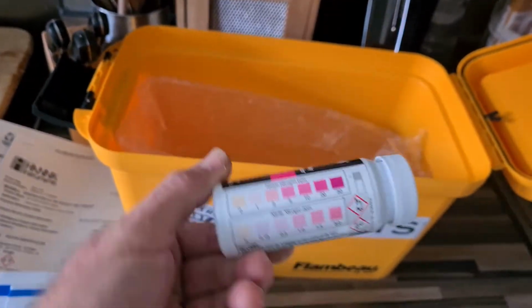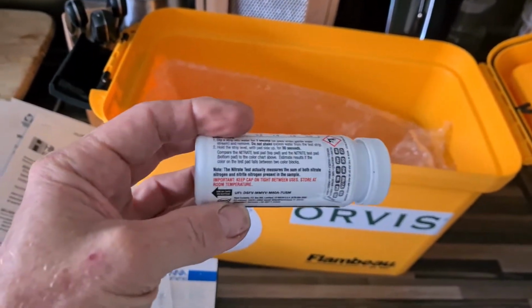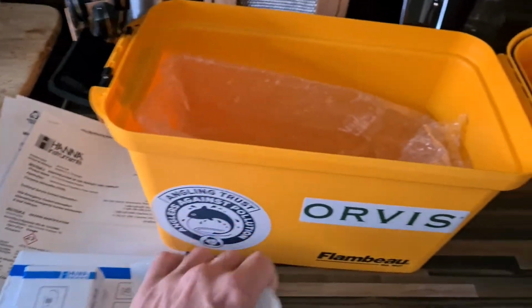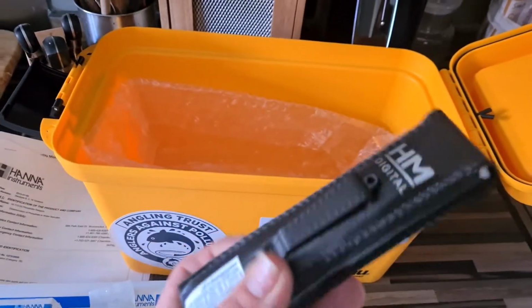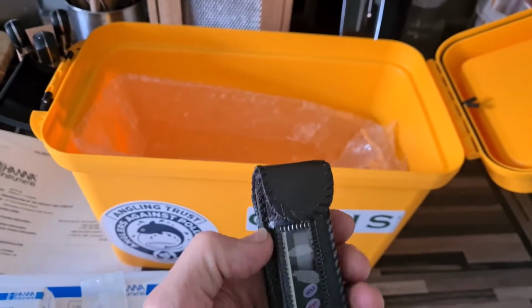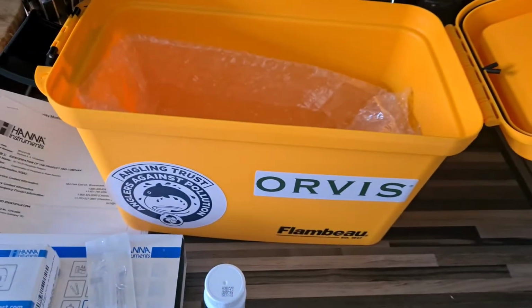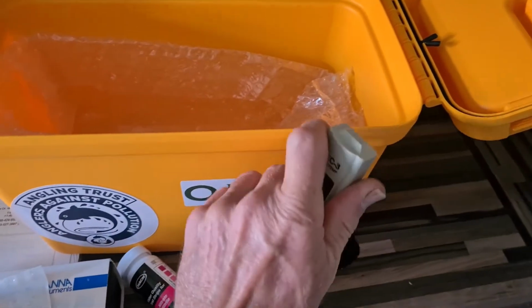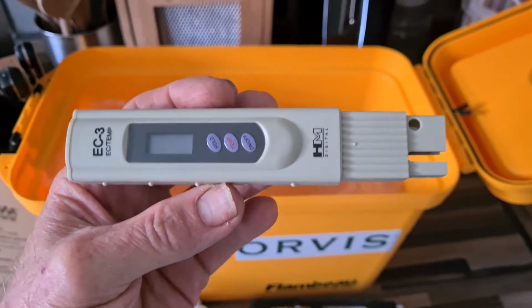Nitrate test strips and your comparison chart on the side. Okay, there's all the details on those laminated sheets of how to use those. And we've got a digital thermometer and electrical conductivity meter. So if I can get that out, just be patient for a second and I'll show you that. Okay, so that is the conductivity meter.